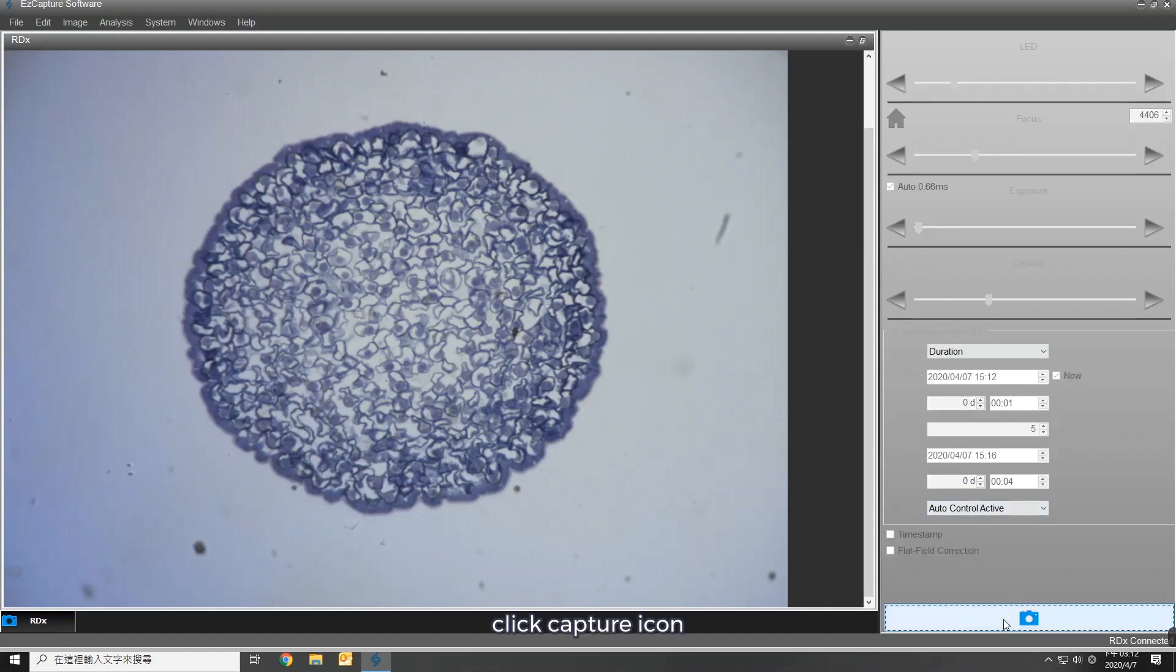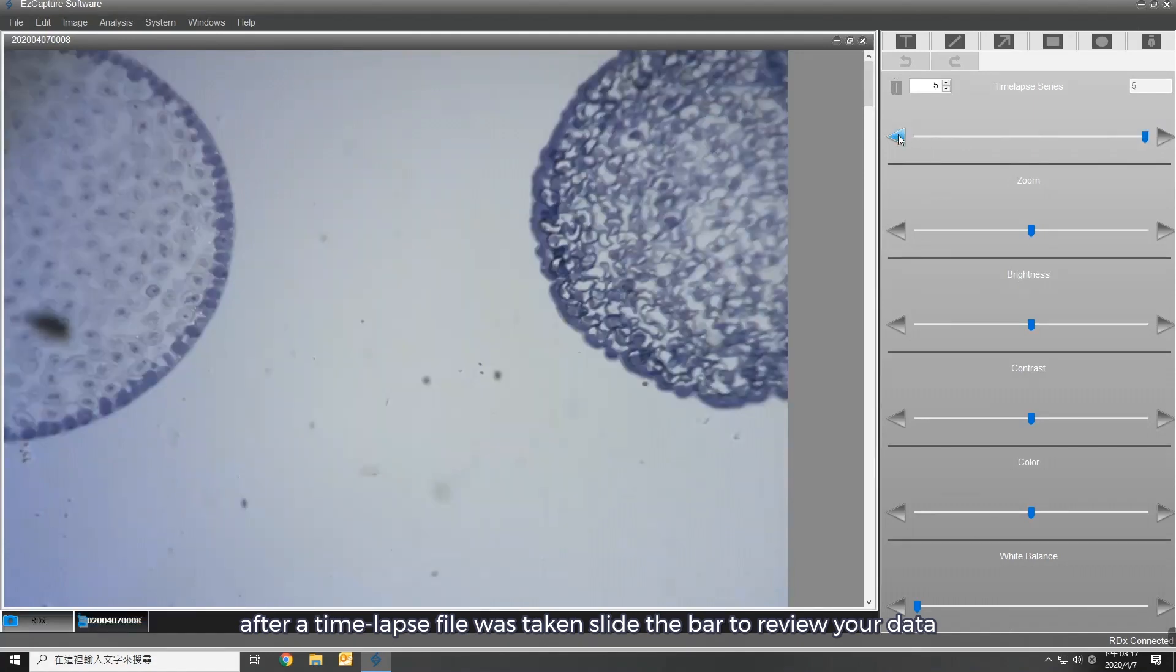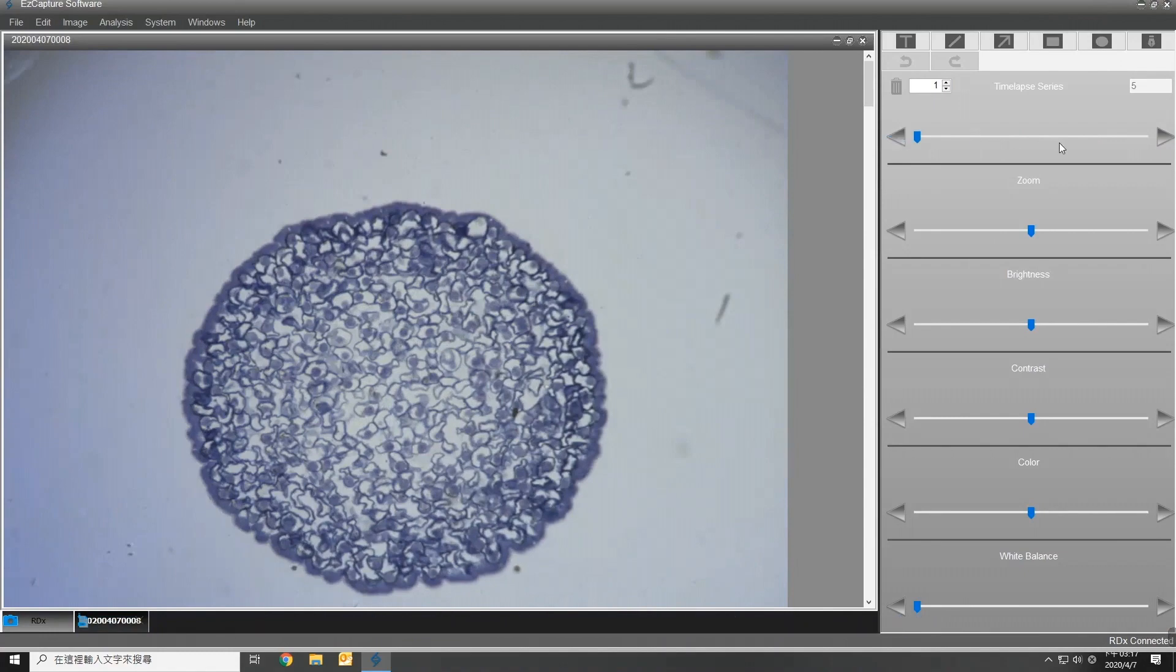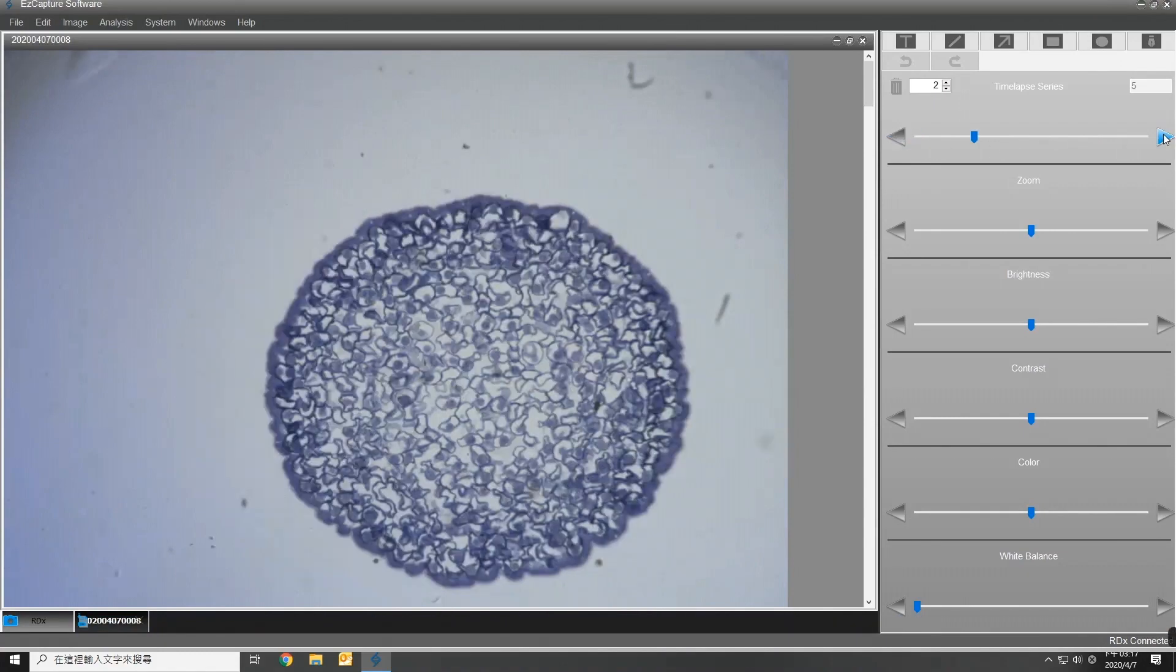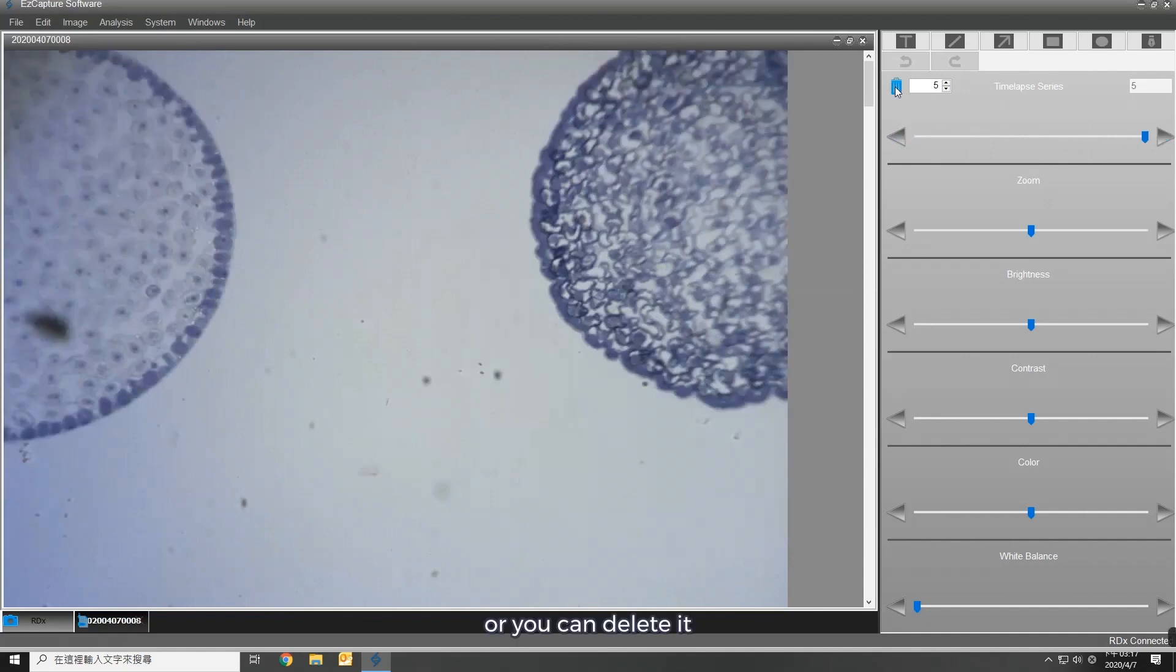Click capture icon. After a timelapse file was taken, slide the bar to review your data. Or you can delete it.